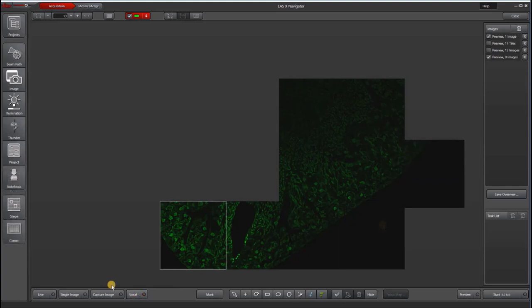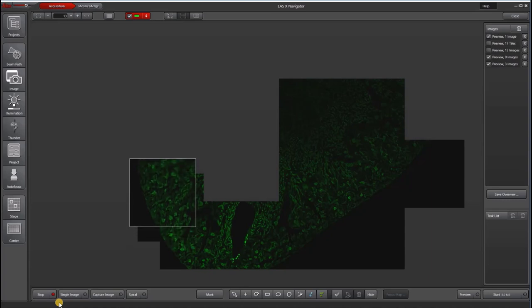Okay. And one of the most useful tools that I like is Run Live Trace. So Run Live Trace will basically allow you to take an image as you're moving, and it is only limited by the speed of your camera. So if you want this to move faster, you can decrease your camera exposure, and that way you can move faster around the stage. So those are the couple of tips and tricks in these two buttons.